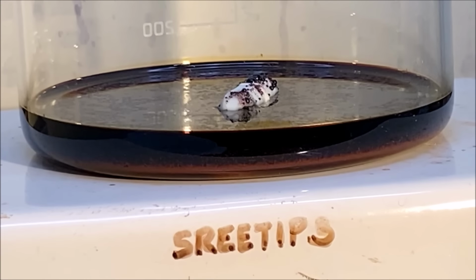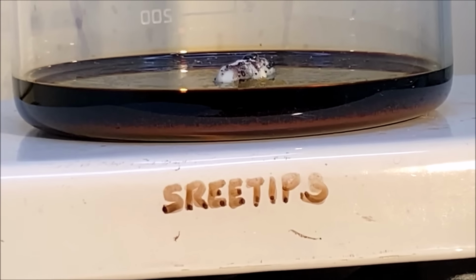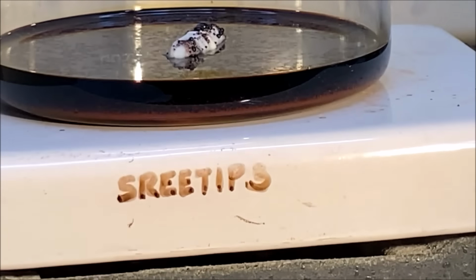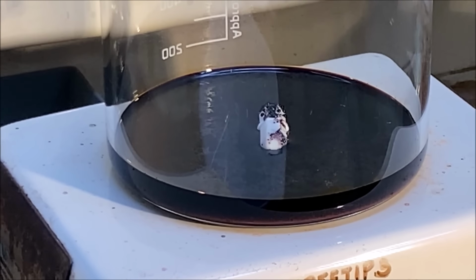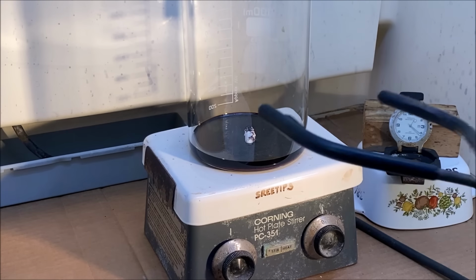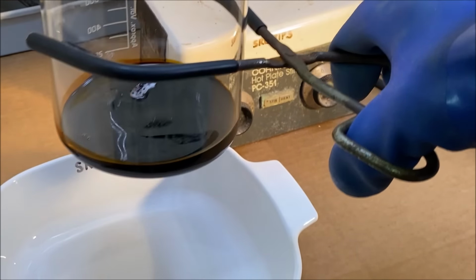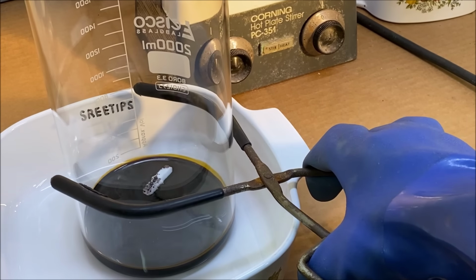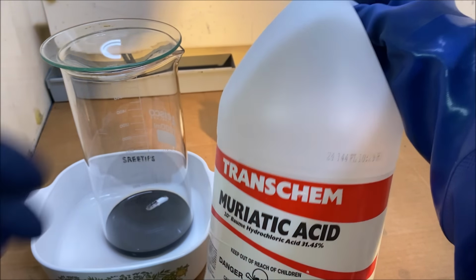I've allowed this to cool completely. There's some kind of orange precipitate in there. Not quite sure what that is. Now what we're going to do is take this down off the heating pad, so we can work with it. I'm going to rehydrate the solution with some hydrochloric acid.